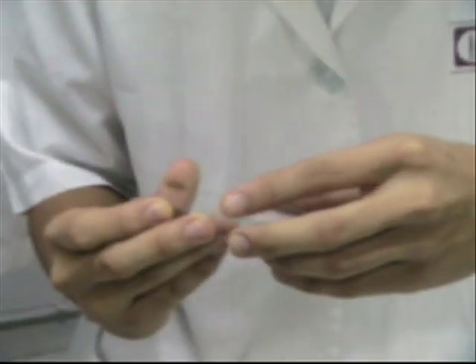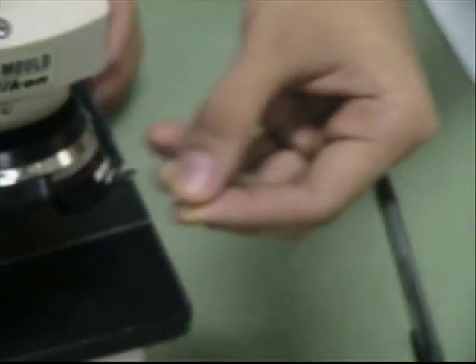Using a light microscope, the specimen was then observed under a scanning objective, low-power objective, and a high-power objective.